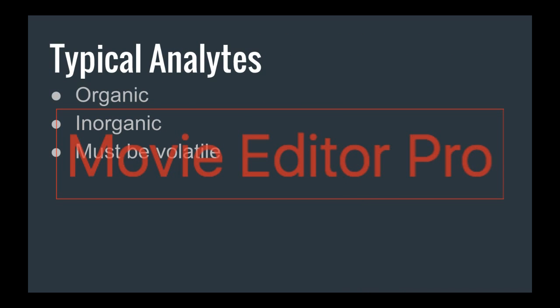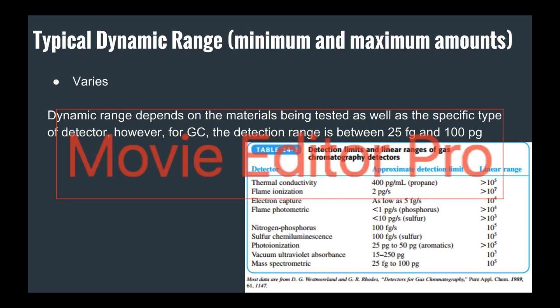The chemical constituents that are being identified and measured, otherwise known as analytes, in GC should be organic or inorganic, and must be volatile. The dynamic range of GC varies. However, the range is usually between 25 femtograms and 100 picograms. But we have to keep in mind that it depends on the materials that are being tested, as well as the type of detector that is being used.